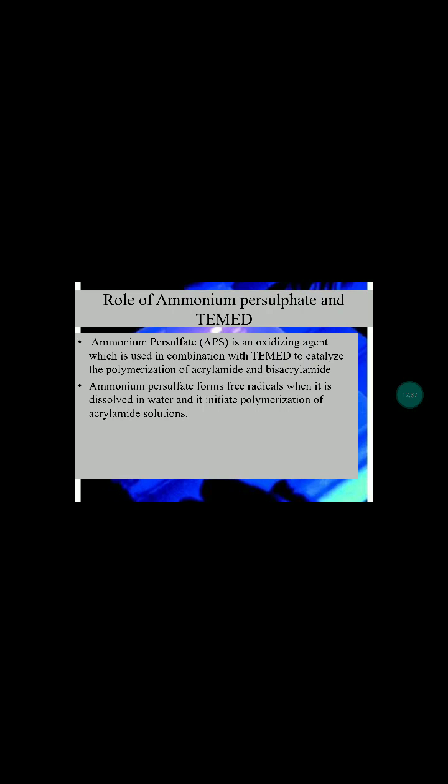The role of APS and TEMED. Ammonium persulfate is an oxidizing agent which is used in combination with TEMED to catalyze the polymerization of acrylamide and bisacrylamide. Ammonium persulfate forms free radicals when it is dissolved in water, and it initiates polymerization of acrylamide solutions.